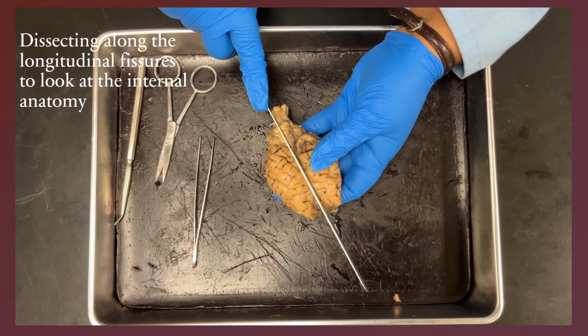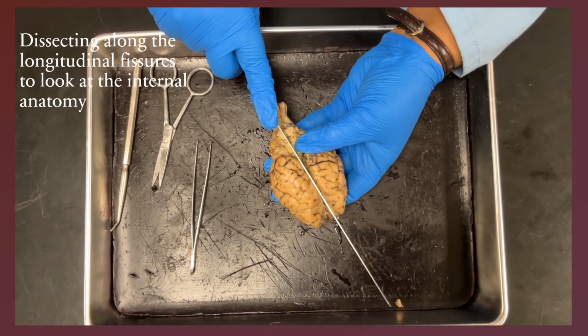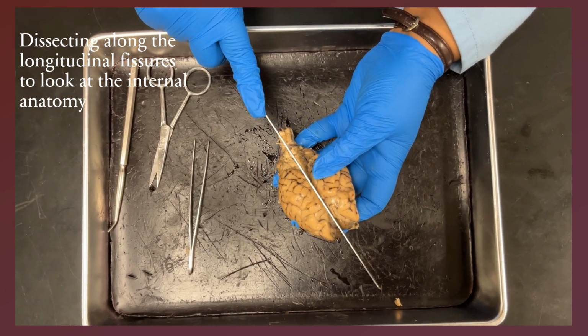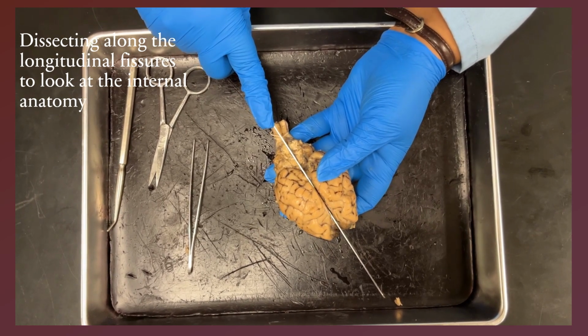Using a gentle force right at the middle of the brain tissue and this long blade knife, I will dissect it into 2 halves.